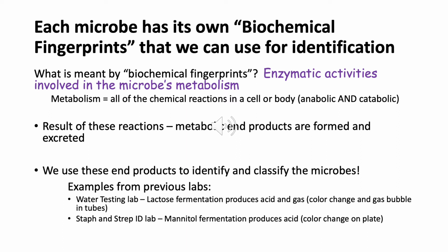So metabolism, you might think of it only as the breakdown of food, but that's only part of what metabolism is. Metabolism is building up molecules and breaking down molecules. So all those chemical reactions are happening in the cell all the time, and the result of these reactions is that metabolic end products are formed and excreted. Now, we've been talking about these in previous labs, so this is not a new concept to our lab. We use those end products to identify and classify the microbes.